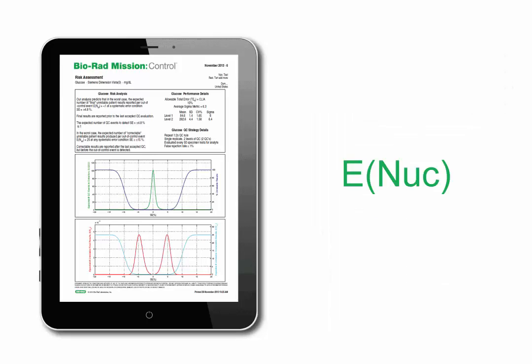This video covers the concept of the expected number of unreliable correctable results reported due to the occurrence of an out-of-control condition, which we refer to as ENUC.